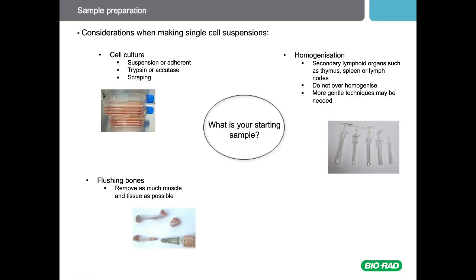You may also be using samples which have been previously frozen. In this case, you will need to rapidly defrost the cells in a water bath at 37 degrees and ensure you remove the DMSO from the defrosted cells quickly by resuspending the cells in a large volume of cold PBS-BSA or PBS containing fetal calf serum before centrifugation. The cells are ready to be stained now. A higher viability, however, may be obtained with some cells if they are left overnight, and some epitopes may need the cells to be in culture for a period of time to be expressed.